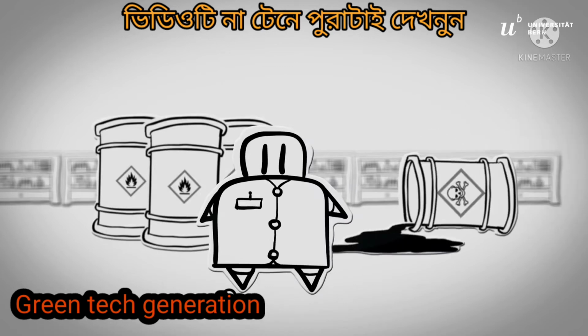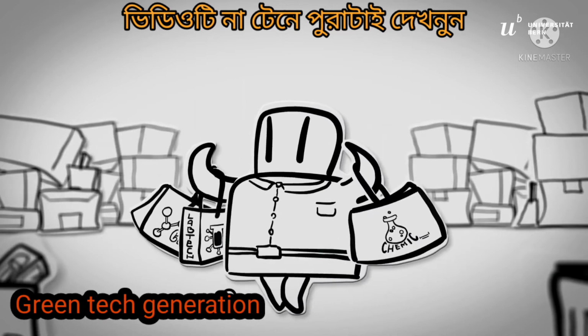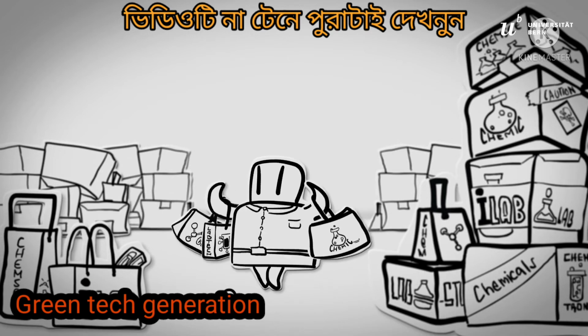Hazardous waste should be avoided or kept to a minimum. When purchasing chemicals, be aware of sustainability. Think about the risks they pose, as well as how to safely dispose of them.